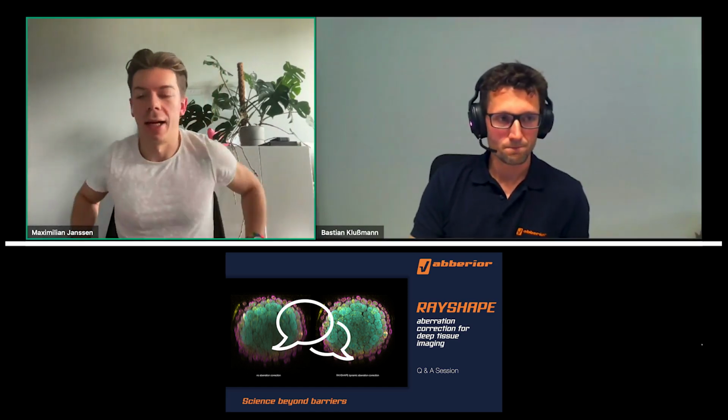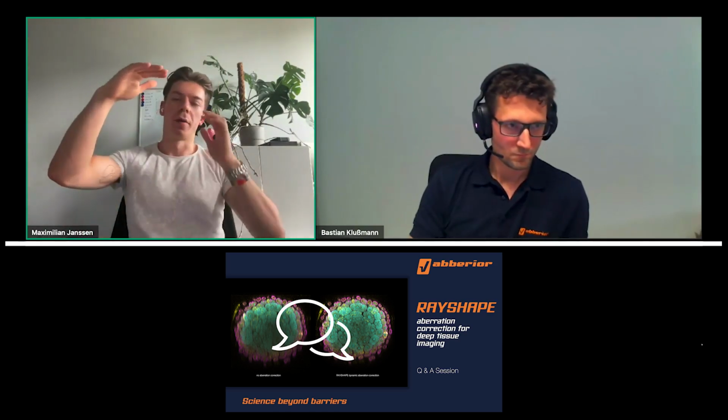Yeah, but the good thing is, I also usually start iteratively, as you said, and take a huge sample and look for the best focus. Afterwards, when I do several samples in different Z layers, the mirror automatically adjusts to wherever you go. For example, I take 3 images in 3 different Z layers. It will always go back to the first measurement you took, where you optimized, and then it will just take the mirror range from this bigger image you take. So you can take some time at the beginning, adjust, and afterwards we just go through the sample that you have.